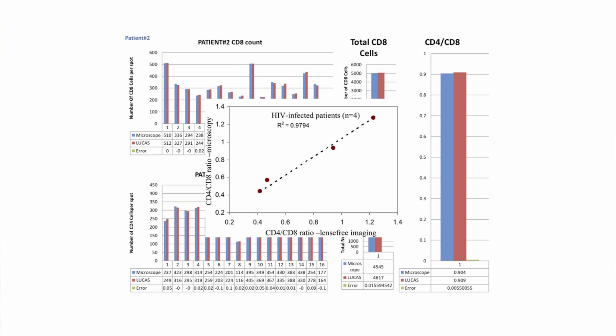This gives you a good example where even a lower resolution microscope that has a numerical aperture of 0.1, on the order of 1 to 2 micron resolution, could be quite useful to specifically image and count these cells, taking the function of a cytometer essentially in your pocket.